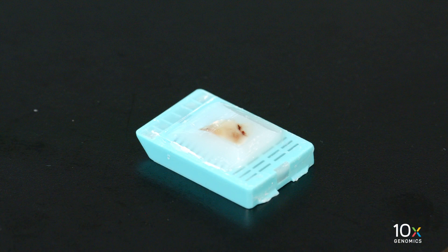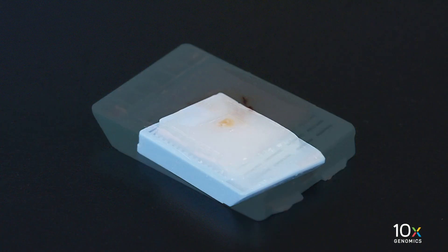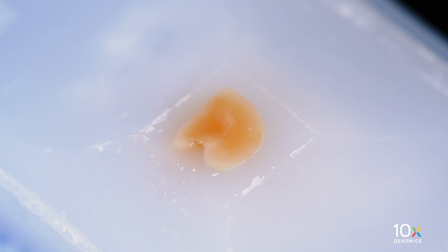The tissue surface should be smooth and shiny and free of bumps at the end of the incubation. Sectioning compression and shattering are usually due to insufficient hydration. In contrast, this tissue block has been over-hydrated, leading to inconsistent section thickness.